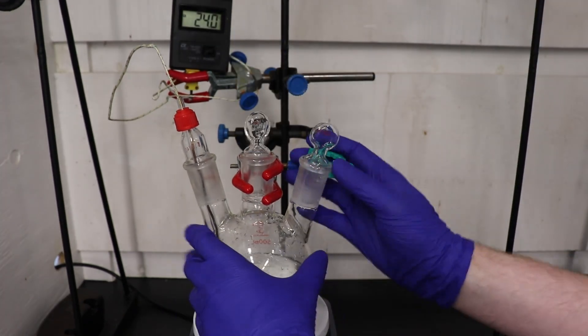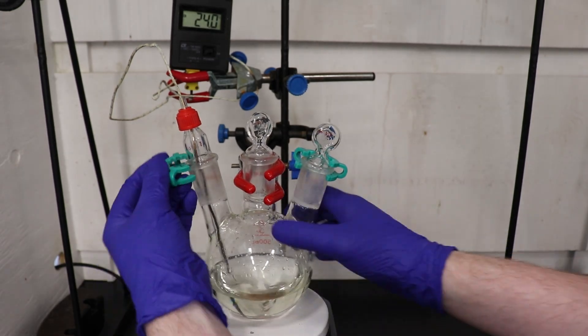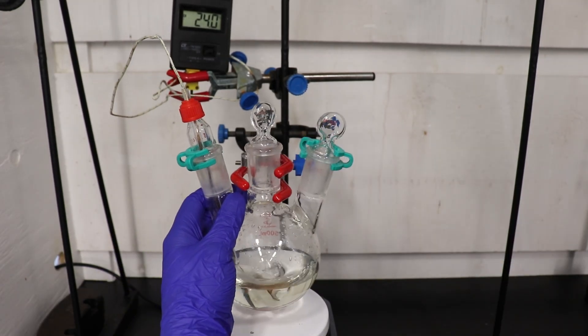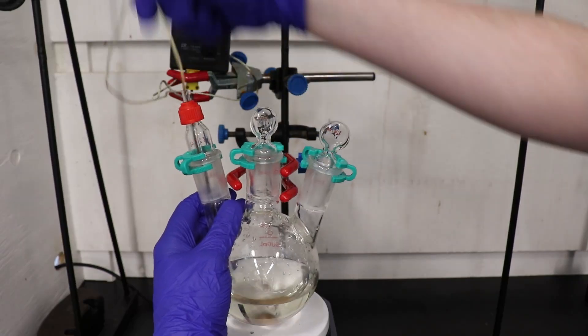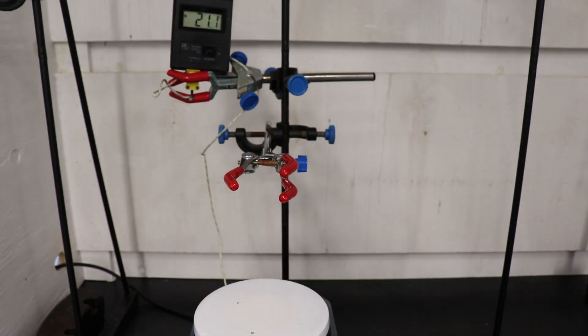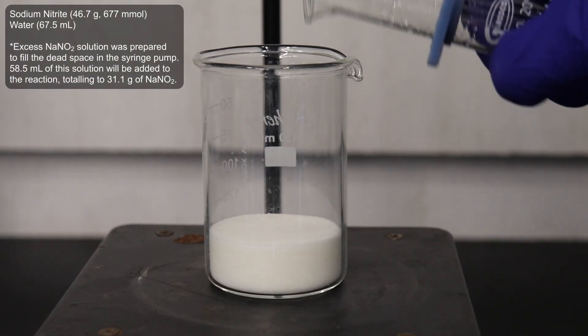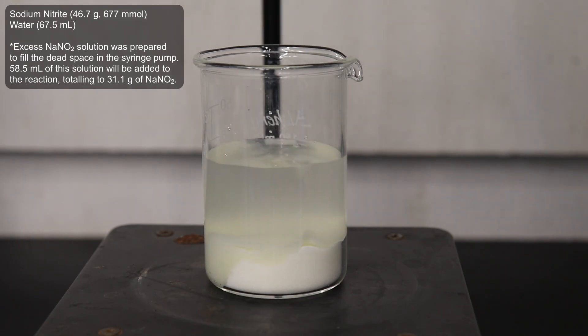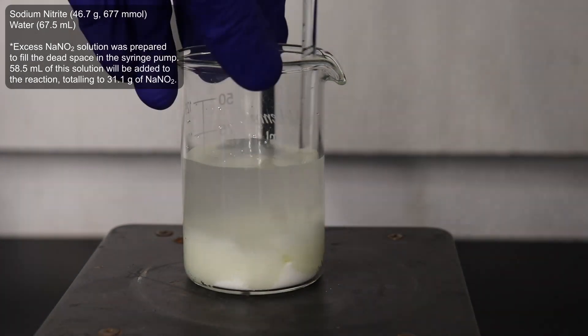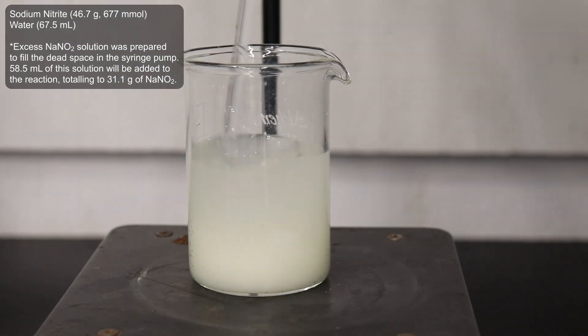Now, this reaction must be carried out at low temperatures, as is typical for diazotization reactions. So, I stoppered the flask and moved it into the freezer to preemptively cool down. In the meantime, I prepared a solution of 46.7 g of sodium nitrite dissolved in 67.5 mL of water, which was set aside and allowed to warm up to room temperature.